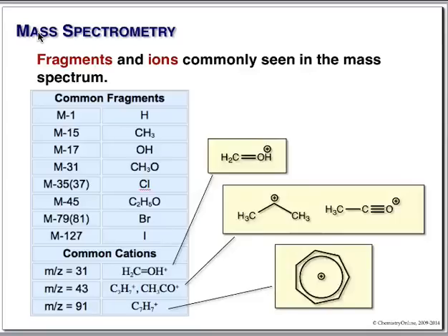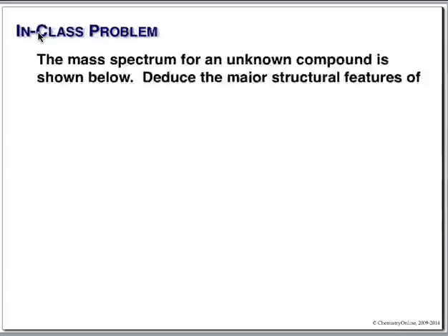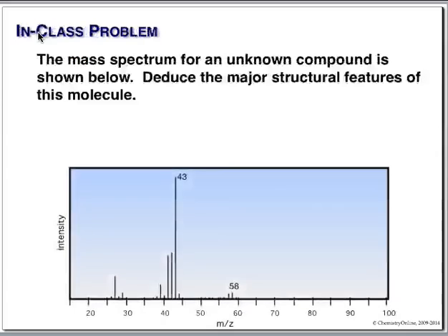Now, as complicated as all this seems, you'll be amazed how easily you can take a mass spec and actually say a lot about a simple compound. So let's do one. If we look at this, after we get over the initial fright, we would say, well, this must be our molecular ion, here about 58-ish.